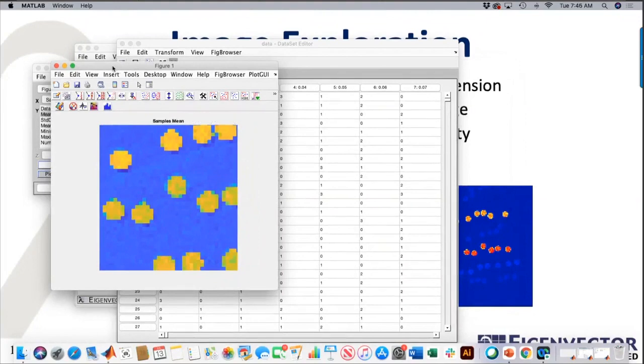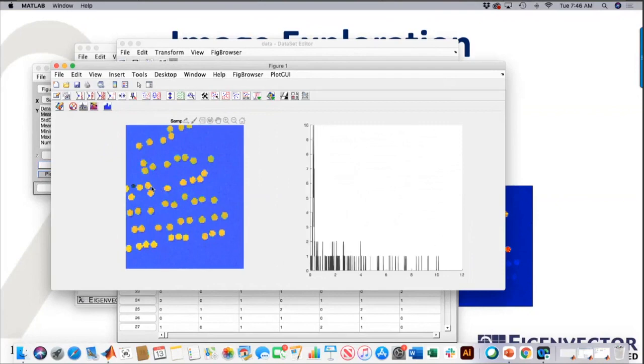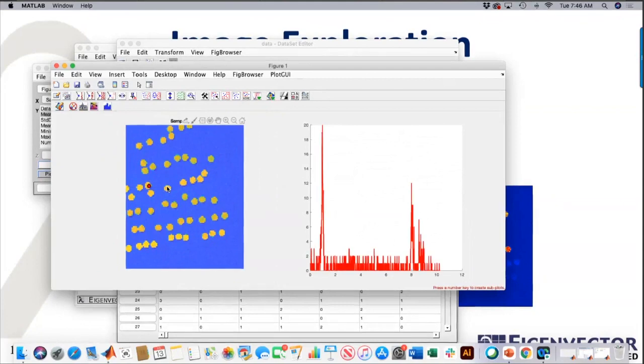You know, when you're using the drill tool, you can double click and put down a couple of different markers. So if you wanted to compare those spots, and I always forget that. So there, compare a few here. Just like that.